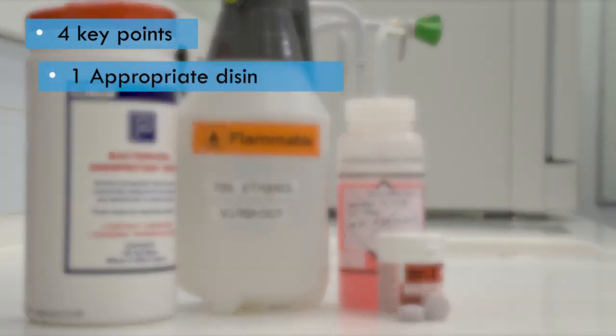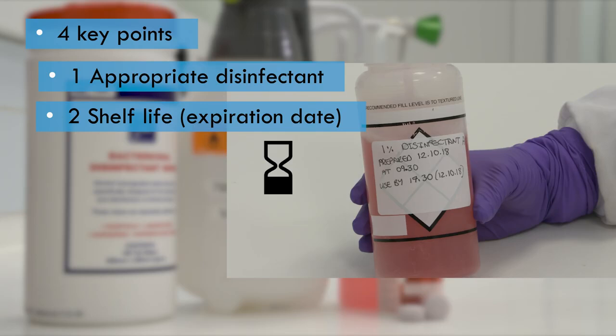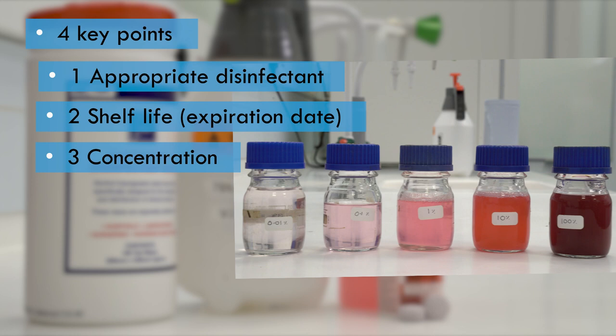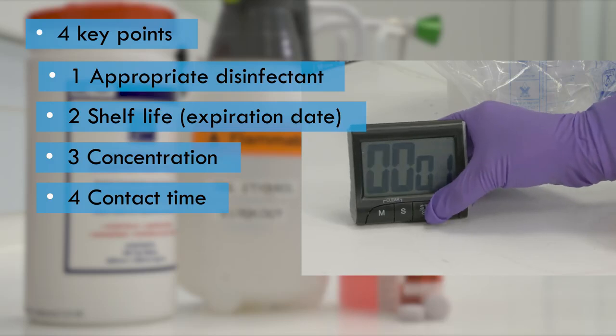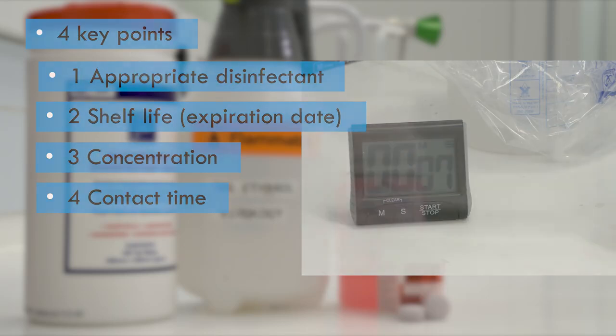You are using an appropriate disinfectant. This must be effective against the biological agents you are handling and safe to use on the surfaces you are decontaminating. The disinfectant is within its shelf life, also known as its expiry date. It is being used at the correct concentration. And it's in contact with the contaminated surface for the right amount of time to inactivate any biological agents present.